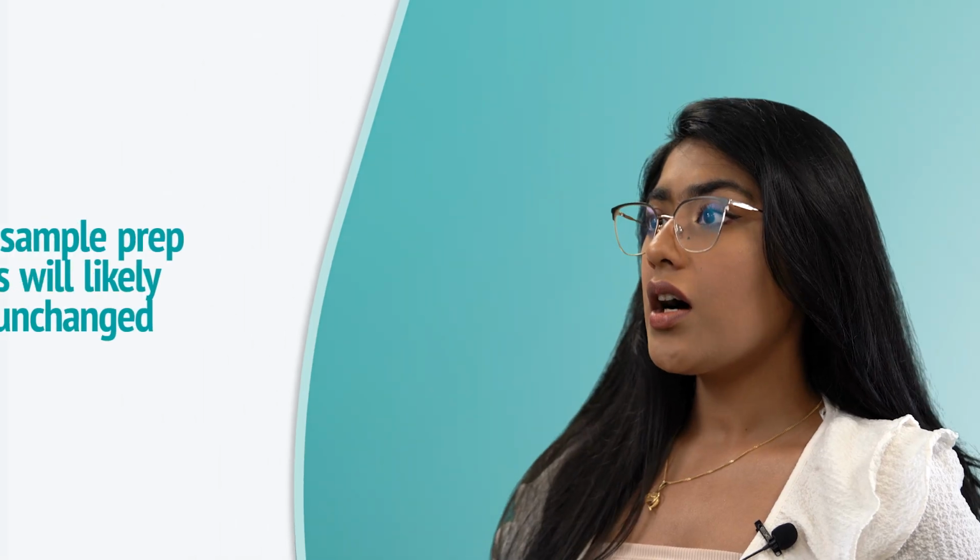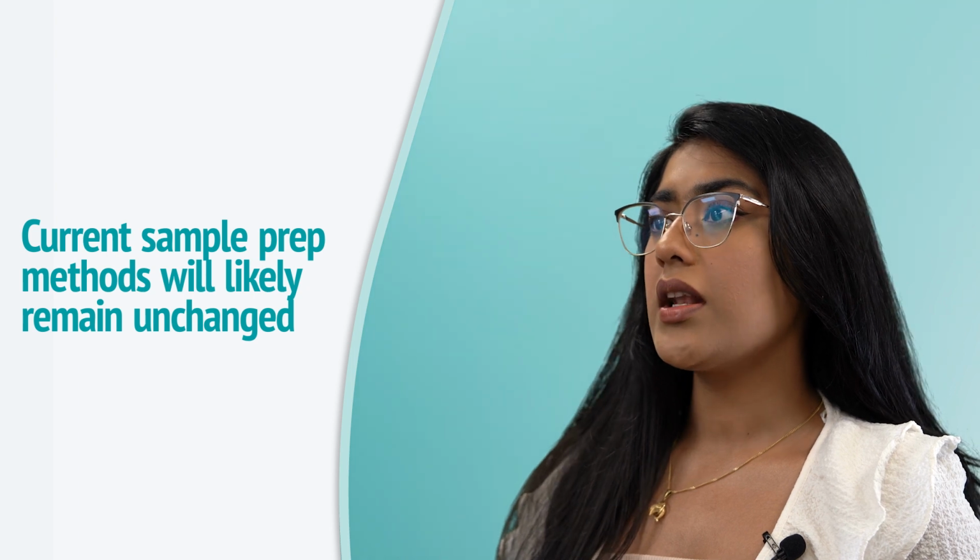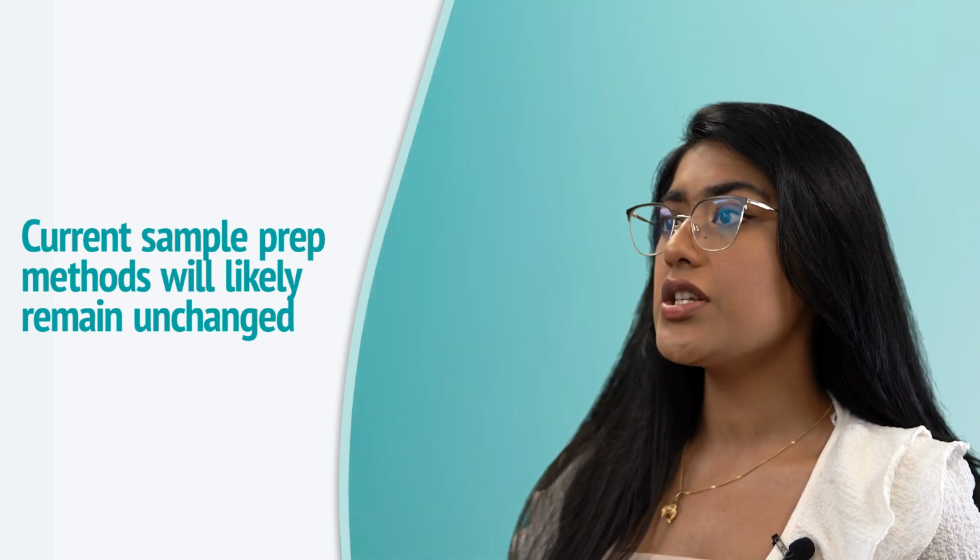Now let's proceed with the sample prep. It's important to note that the sample preparation steps demonstrated here are specifically tailored for ranitidine. Your current sample preparation methods will likely remain unchanged when utilizing this analyzer.